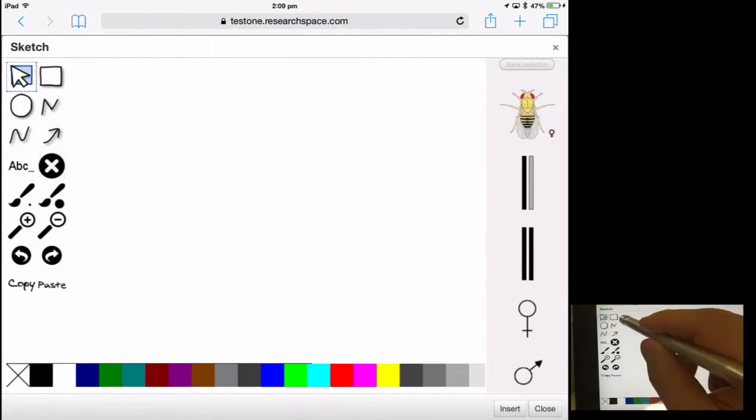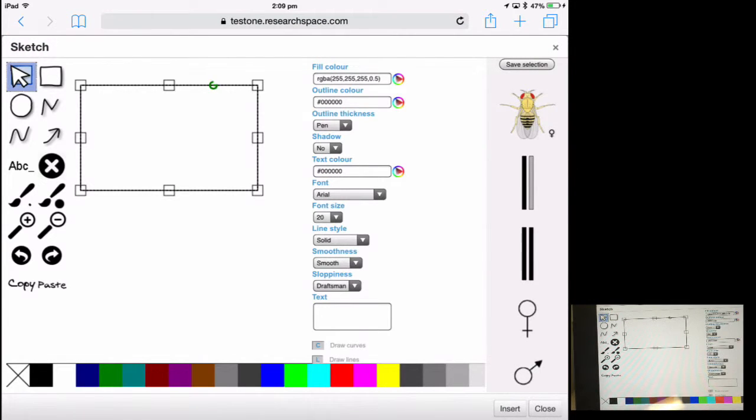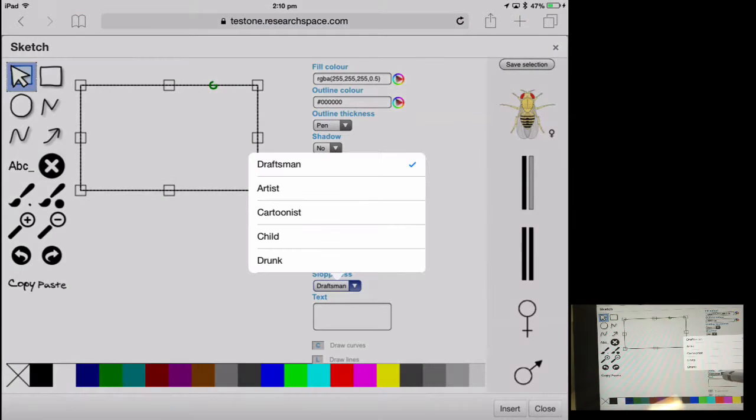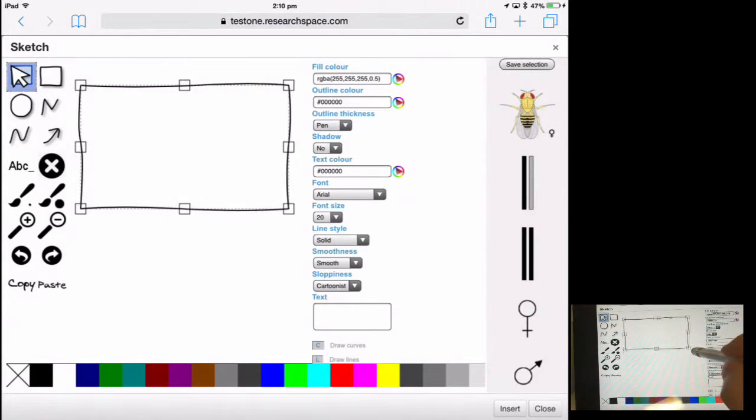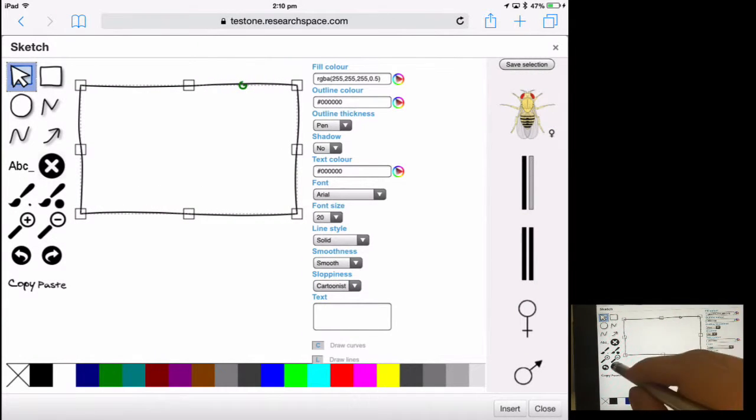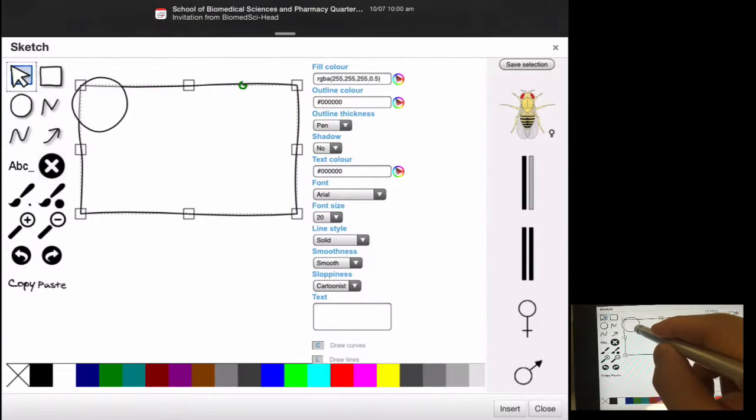Once the sketching pane loads up you're able to draw rectangles and circles, much as you would on the desktop version through a standard web browser.